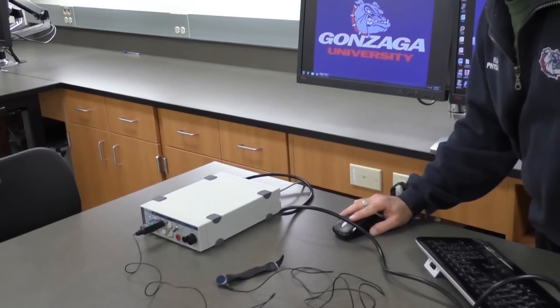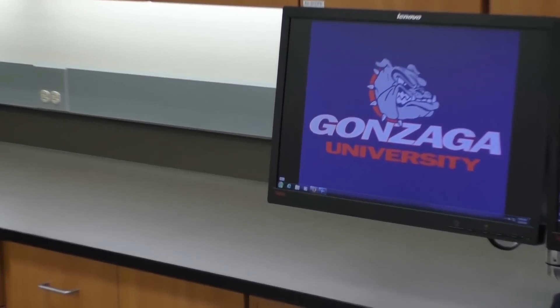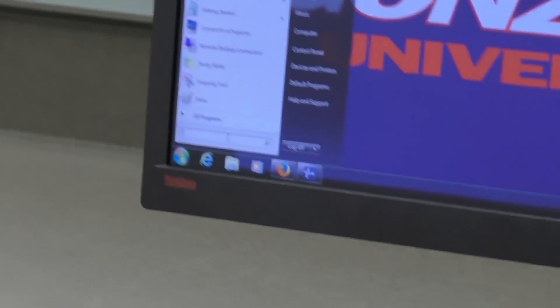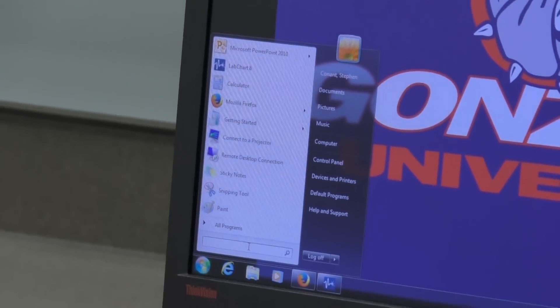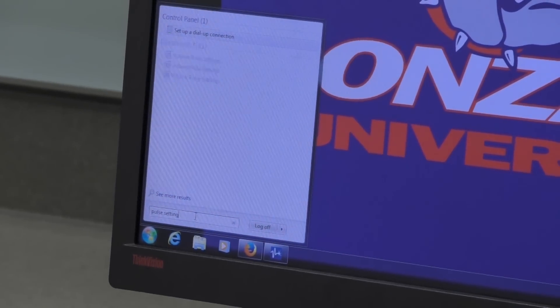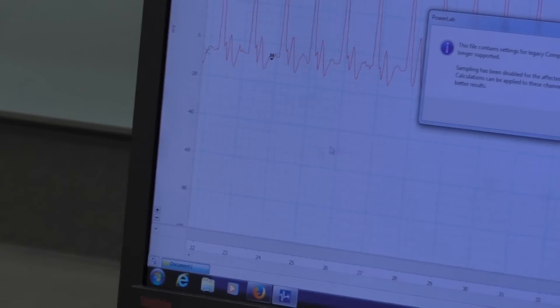First, I'm going to go over here on the screen. I'll click the Windows icon, which gives me a search menu. In this search menu, I'm going to type in whatever I'm looking for — the file for this week's protocol is called pulse settings. Once I type that in, I get a couple of options and I click pulse settings. Here I can see a blank screen but also a green start icon. The start icon being active means I've set everything up properly and I'm in communication between the PowerLab box and the computer system.